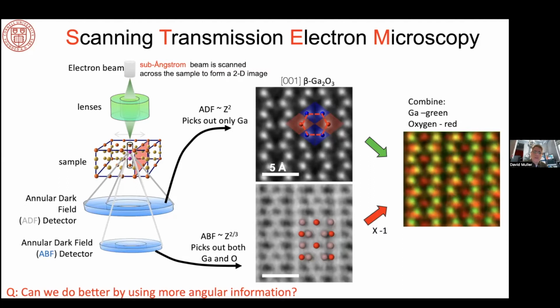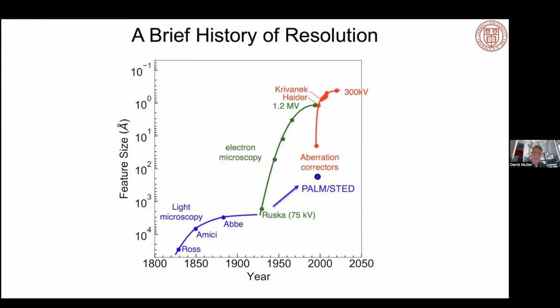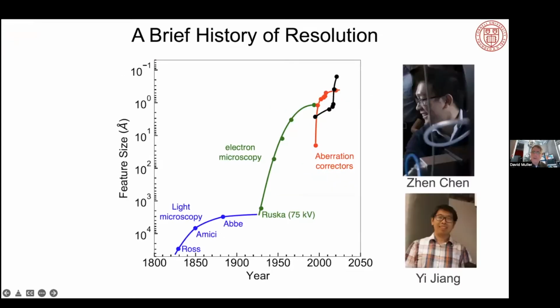But for electron scattering, this is actually quite a tricky thing to do, because as you can imagine, an atomic resolution image doesn't stay stable for very long. So you need a very fast detector. Otherwise, by the time I've collected the data, things have drifted and vibrated all over the place. And electrons have a much steeper angular distribution, angular fall-off, compared to X-rays. So we get much less information at high scattering angles. And so the detectors need a very large dynamic range in order to collect that information. So I'm just going to jump ahead on this one over here.